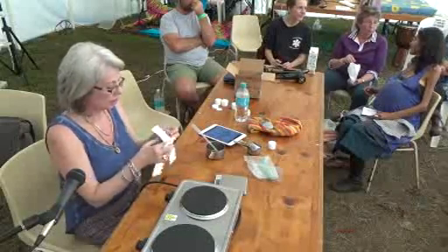So the little plastic stand is really handy, but if you have a friend that does woodwork, you can make one out of wood, or I've even made one out of a cardboard box.